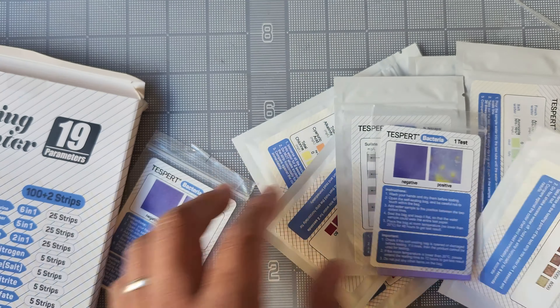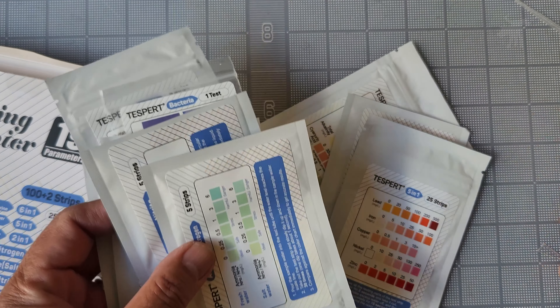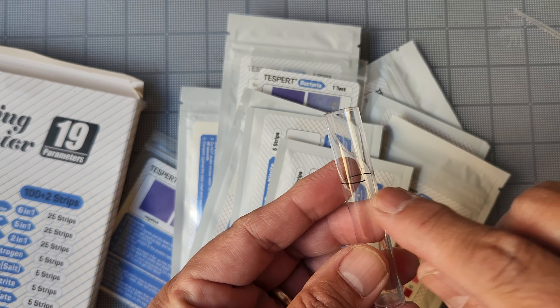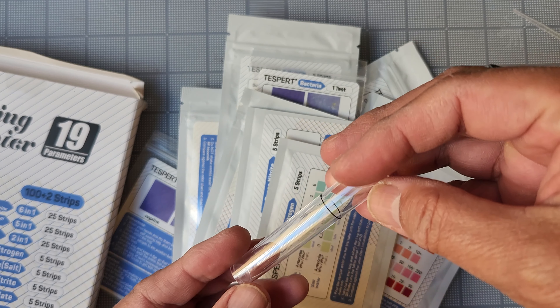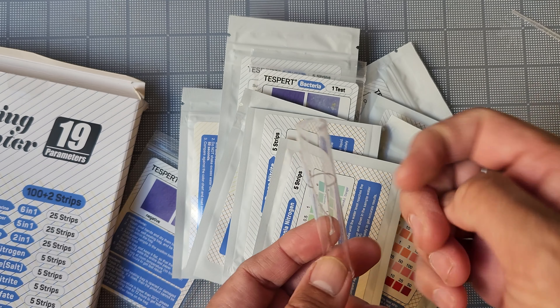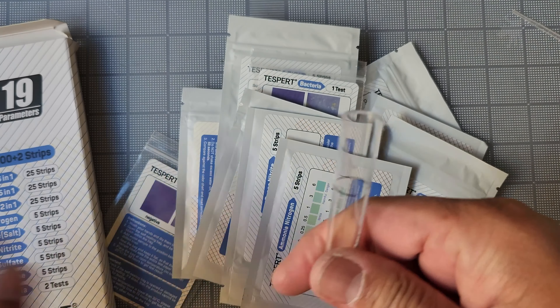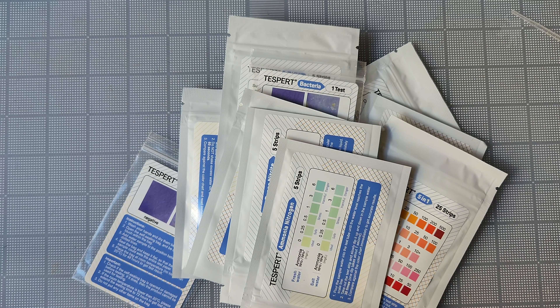The kit comes with 19 individual test strip kits, along with a plastic pipette, and in my case, a broken plastic test tube. So be sure to check your package when it arrives. Mine was shipped from Amazon in a plastic pouch with obviously not enough packing material. I don't have the time nor the expertise to test out each of these test kits, especially the heavy metal ones, but we can test two of them to see how sensitive they are.